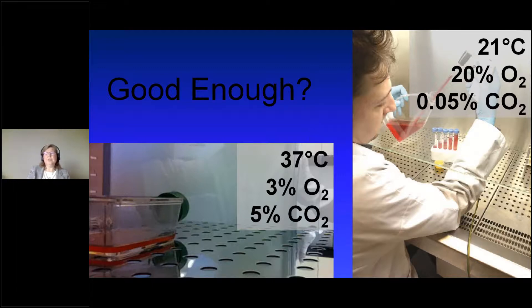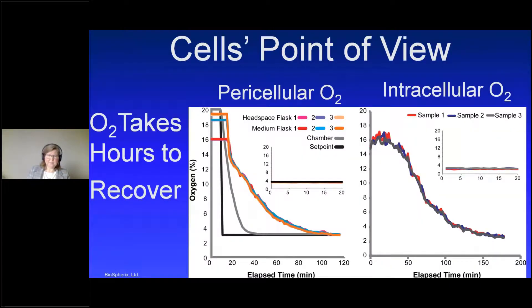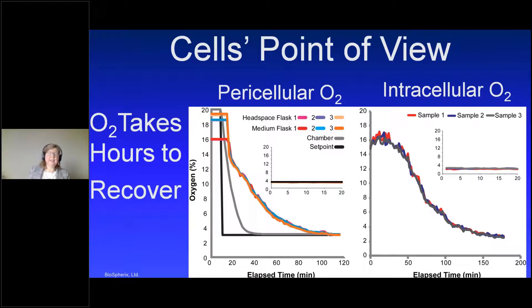This is data we generated showing what happens at the pericellular oxygen level — in the medium when cells are subjected to a quick medium change in room air oxygen. It takes almost two hours for those cells to get back to 3% oxygen after a quick room air medium change, and it takes almost three hours for the intracellular oxygen to return to 3%. The inset graphs show what happens with full-time control of conditions — the cells have full-time optimal conditions, never out of optimum. When cells are out of optimum for hours, this is an eternity for a cell.